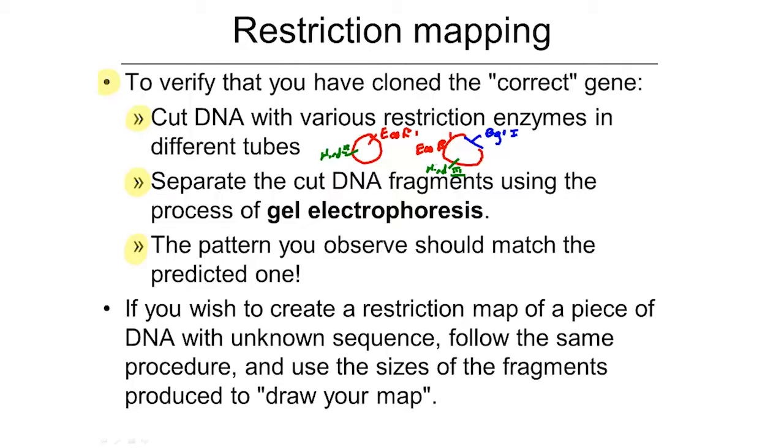Okay, the reason I did that is because we're going to do a mixed digest, put EcoR1 and HindIII in there. Here you're going to get fragments of two sizes, right? So on a gel, you might see that.